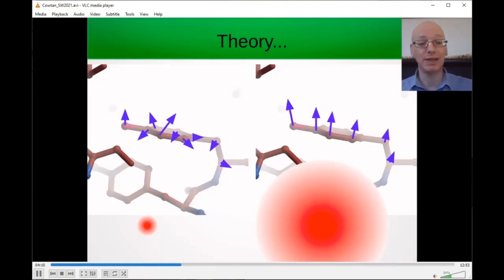So we end up with big coordinated shifts which vary slowly over a whole region of the map. So that gives us the kind of shifts we want to see without needing stereochemical restraints at all. And that both makes the calculation faster, and it makes it better able to pick out these large domain shifts that we want to detect.